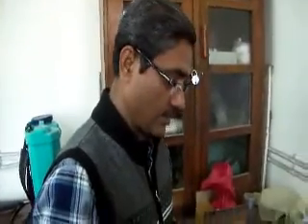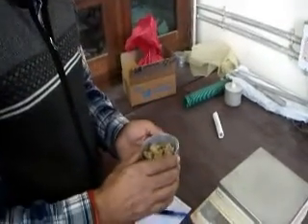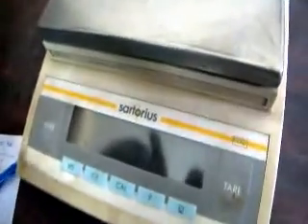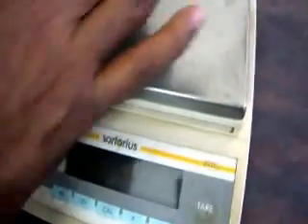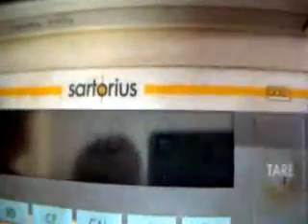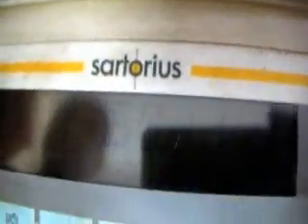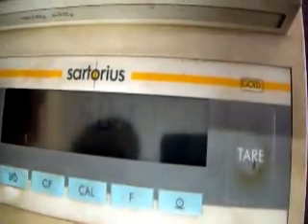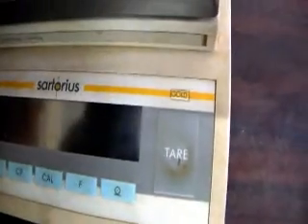Now after 24 hours of drying of these soil samples in this box, we need to measure the weight of dry soil plus box. Now it is 00, the balance reading. So let me put box plus soil, that is 60.11 gram box plus dry soil.